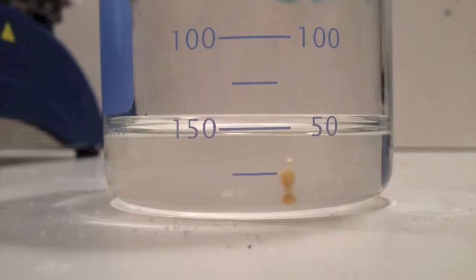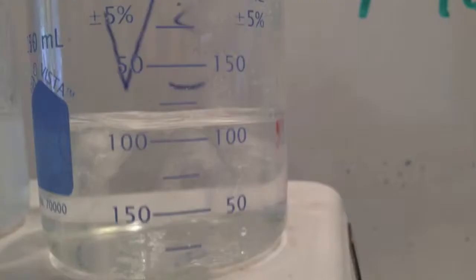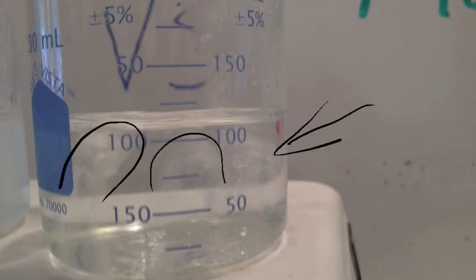Some of the procedures. You need 150 milliliters of distilled water in a beaker. You're going to put that beaker on the hot plate and then start it boiling and slowly add the salt solution to it while it's boiling. Here you can see some of the salt solution inside the beaker, and you can also see that the water level is changing. You can see the bubbles boiling, but you can also see things happening inside this beaker.